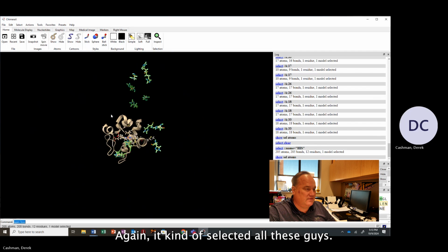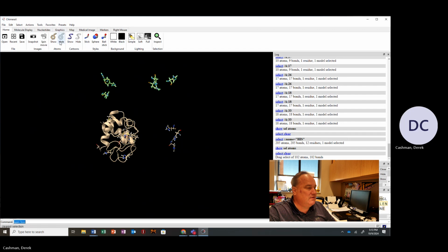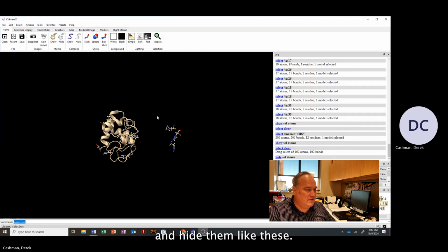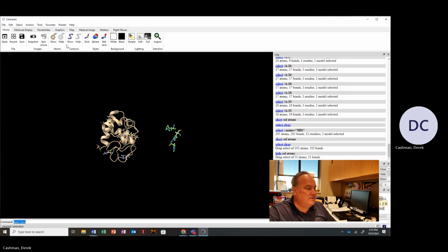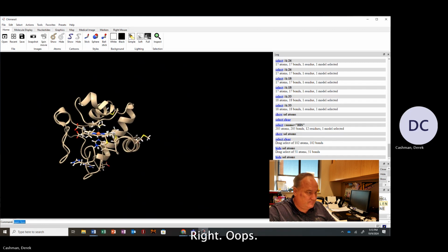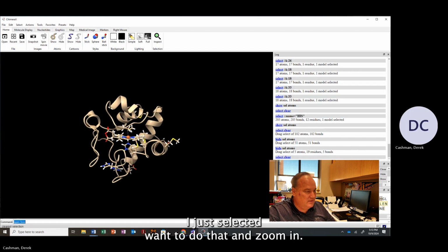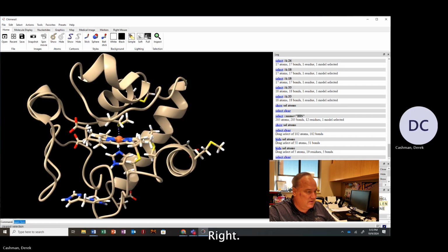Again, it selected all these guys. So let's just select these and hide them and select these. So you do a lot of zooming in and out with the protein to get what you want, right? Whoops, I just selected. I want to do that and zoom in, right?